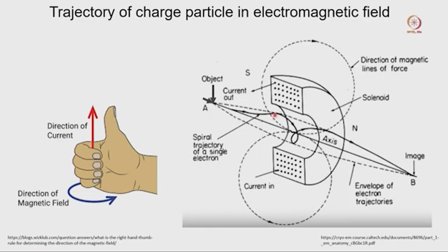So exactly, if you go to this diagram, you can see there is a change of the motion of this electron in this particular direction. When it is somewhere here, it will again face this kind of motion, the electron is pushed in this direction, and finally it enters the other magnetic field going through this cycle. When it enters, it will feel the opposite force and start deviating from its actual path. So now if you follow this one, we can see a spiral movement of this electron.